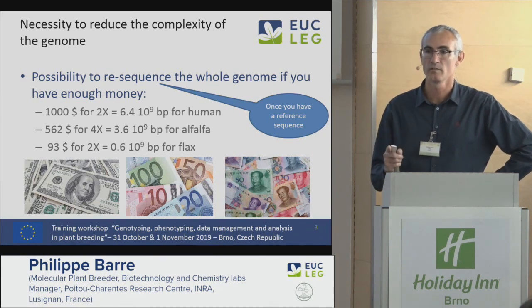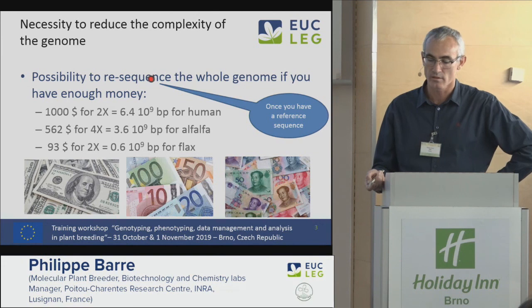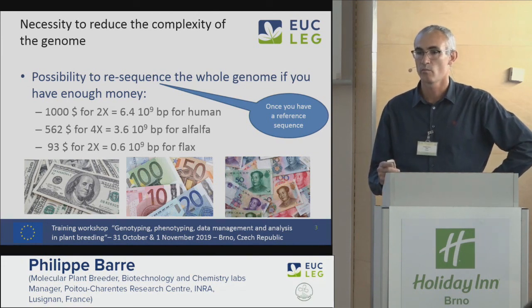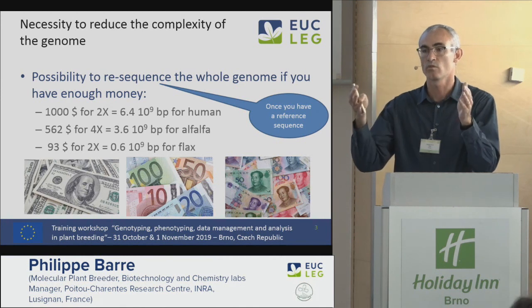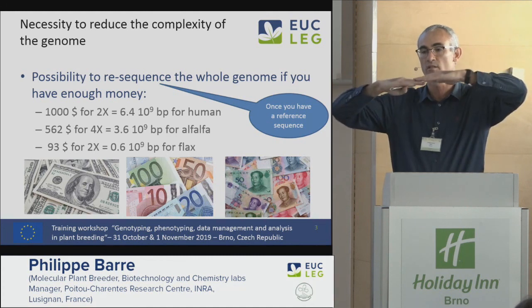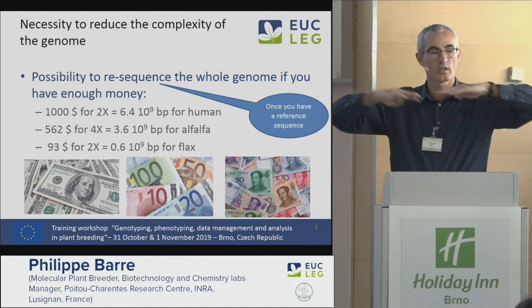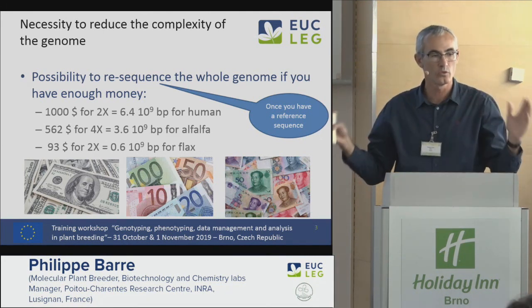Just one point here. You see, I didn't say sequence here. I say resequence, or resequencing. Why? Because by that I mean, first of all, you need a good quality sequence. It's much more expensive because you need to get the sequence without any errors. But in addition to that, you need to build the sequence and put together, to assemble, all the little parts of the sequence to get a good quality sequence.